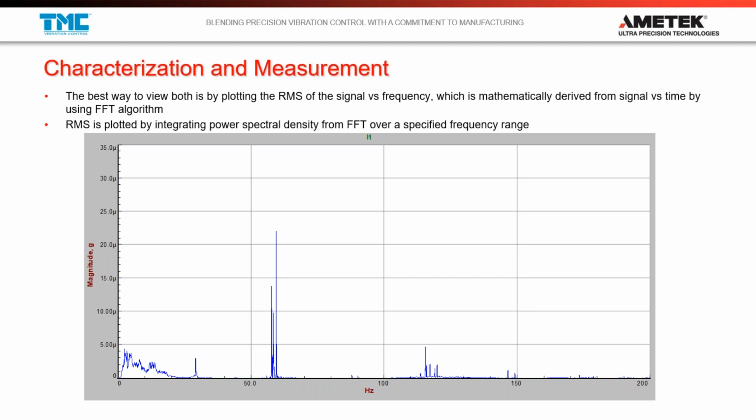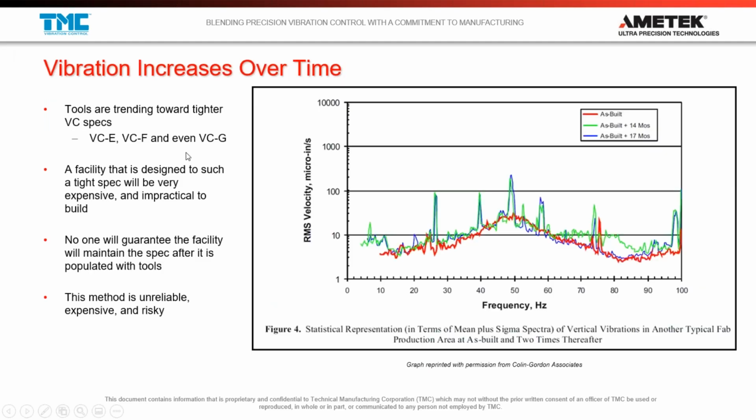And this chart is a little bit misleading because it shows that the 60 hertz problem is much higher than the low frequency problem, but in reality, it's really not that much higher. It's only 4 times higher. And I can slice and dice this a little bit more and use logarithmic plots on the y-axis and the x-axis, but I don't want to go too much into signal processing. I just wanted to point out that we got to do a fast Fourier transform on our noise source. We can try to start to identify what sources we're dealing with.